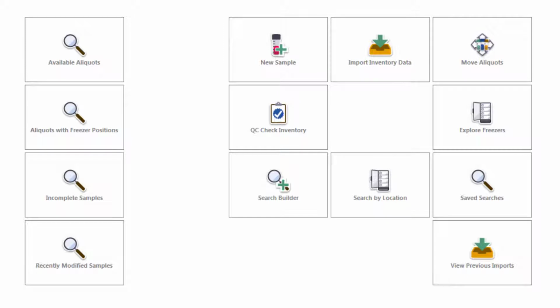Today we finish up our series on the new Sub-Aliquot workflow type. Last time I showed you how to configure a Sub-Aliquot workflow, so let's take that one I created and process it. Again, I'm going to speed through much of the workflow process to focus on the Sub-Aliquot side of things. So if you need more assistance with workflows in general, there's a whole other series on them that you can watch, or you can consult our user's guide.